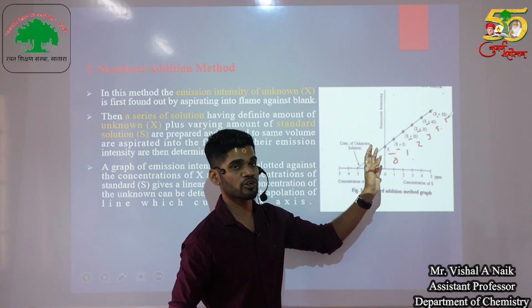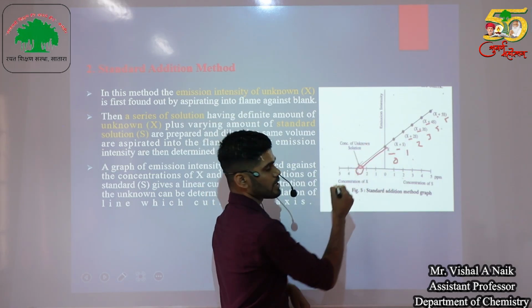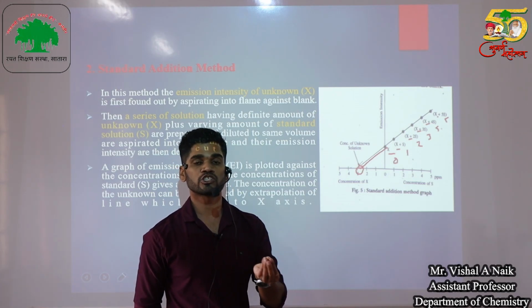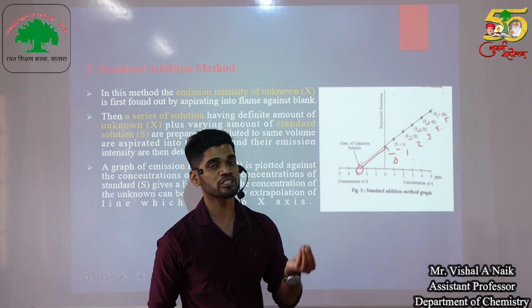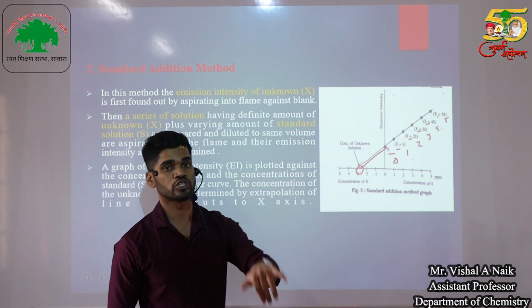We get this type of graph, and if we extrapolate that graph to the other side, on this side, we get the concentration of our unknown sample solution. So this is called the standard addition method, because we add the standard solution in varying amounts.